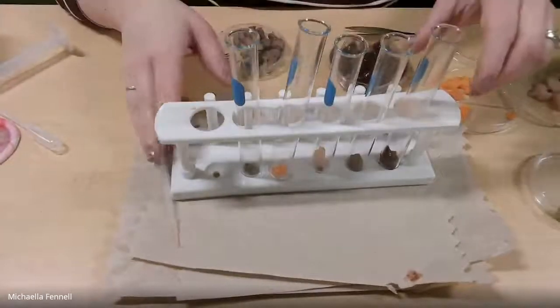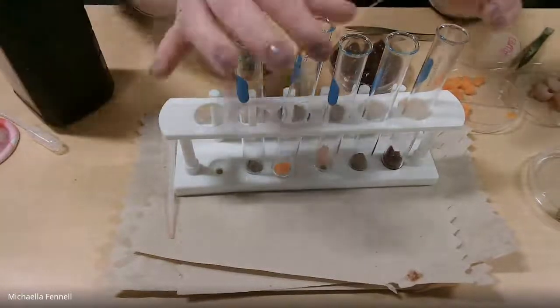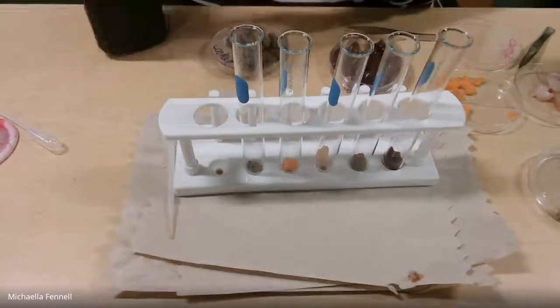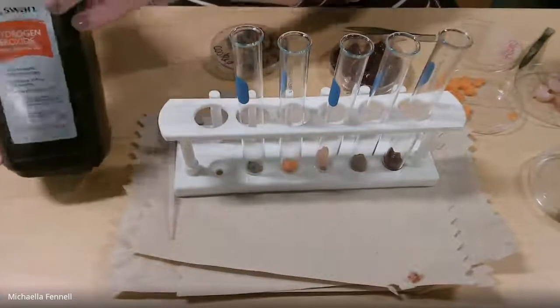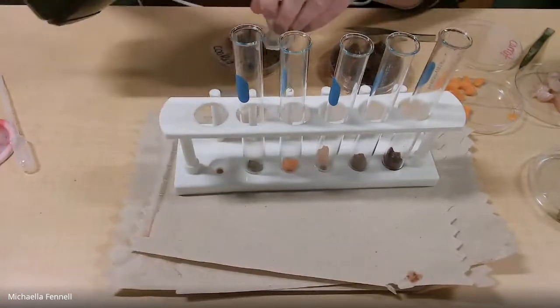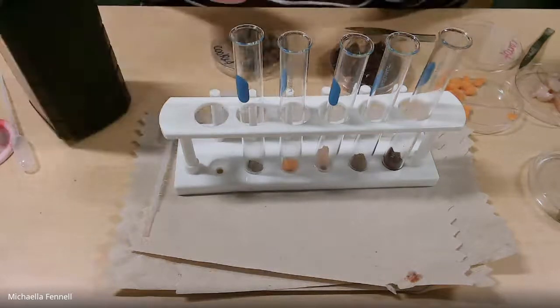All right. There's catalase in the cells of these different living things. So what we're going to do is take our hydrogen peroxide. You can't see that there. I'm going to measure out 10 milliliters of it and put it into each test tube. So here's 10 milliliters on our chunk of potato.